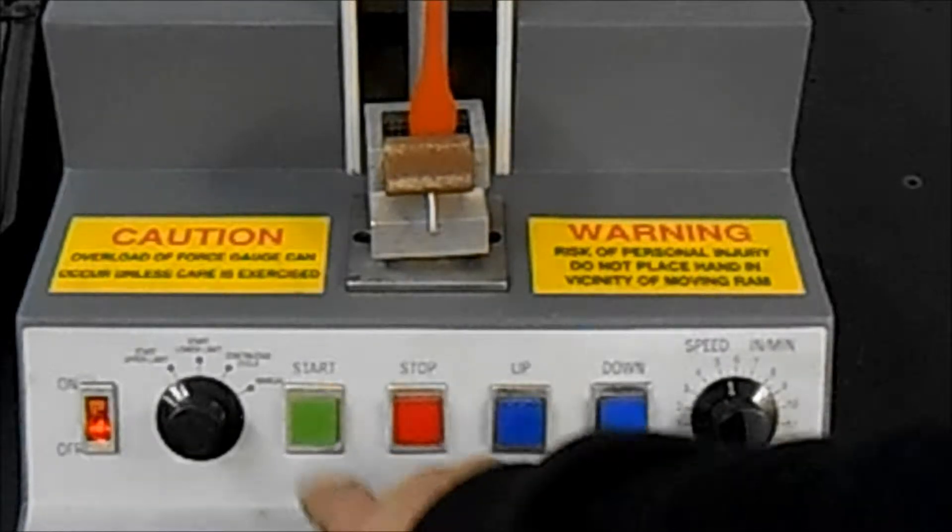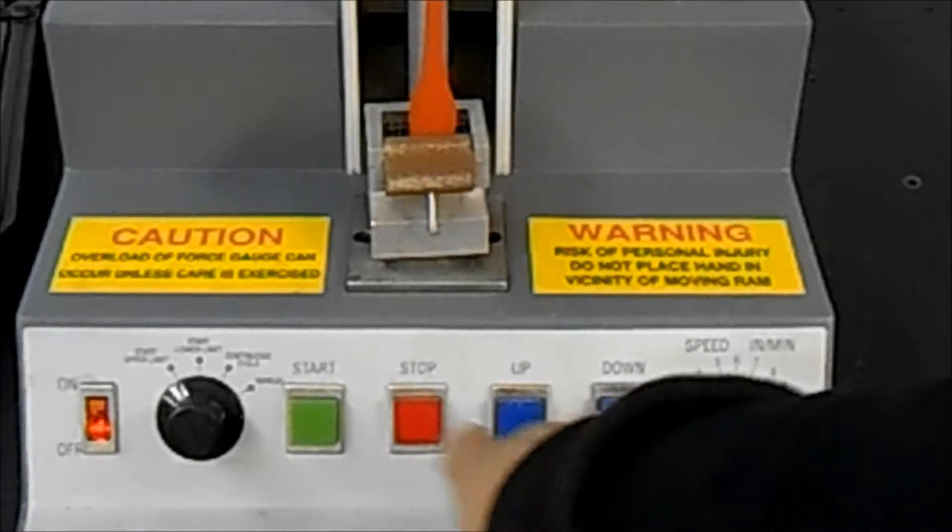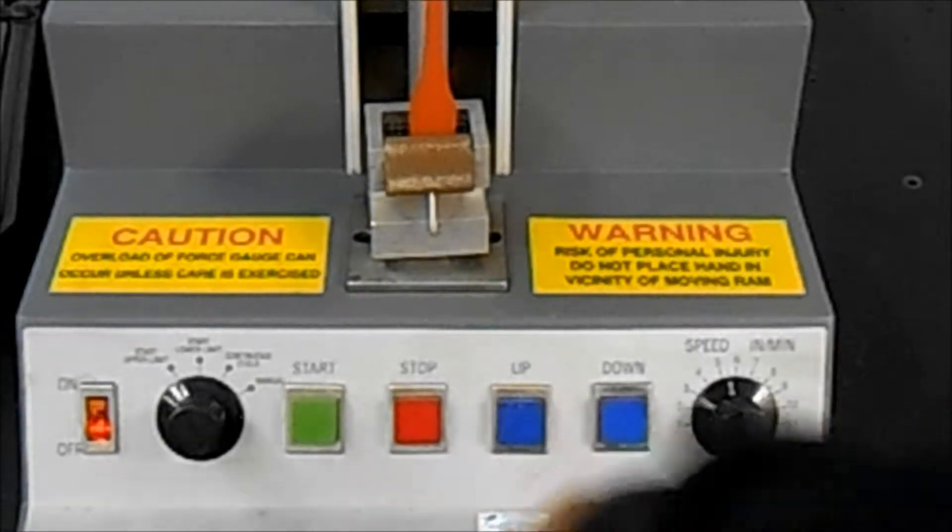We can stop it at any time, restart it, we can change the direction. So it's very well set up. It works.